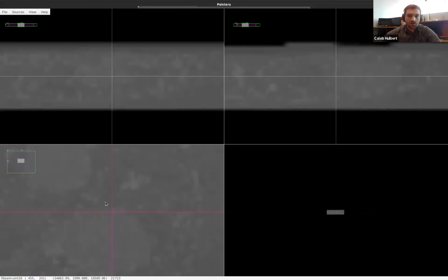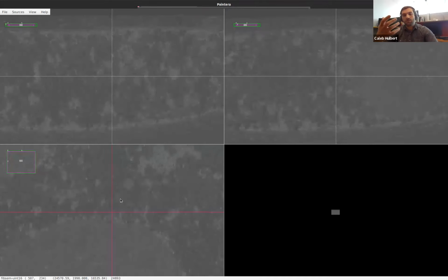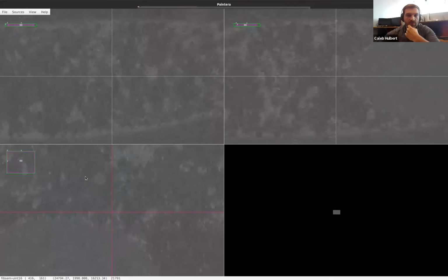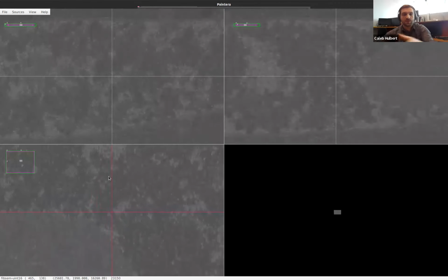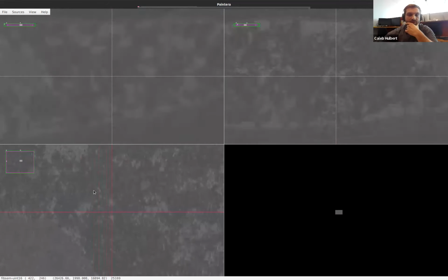Two, it's a huge data set, so you're going to see it's maybe not as quick as some of the stuff that you saw with Alyson, but it's fully supported. And obviously, if you want to hone in on a particular region, it will pull in the high resolution data for the areas you want to look at, just like it would with the smaller case, but obviously it's a bit more obvious when you have really large data sets. As I'm moving through the data, you see the lower resolution blocks come in, and then as they start to load this.